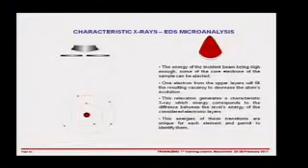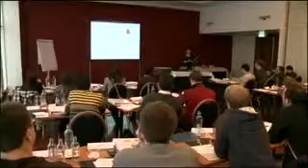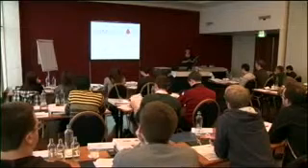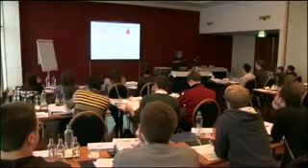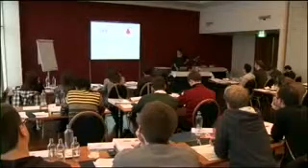So finally in this section, we're going to look at, anybody any questions about backscattered images? In the reading, there's a quite detailed paper I wrote a few years ago all about backscattered electron imaging and what it can do. And if you want to know any more, I think you should find most of the answers there. So finally, we come to characteristic X-rays.